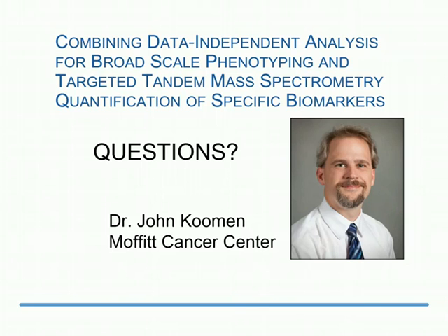What we'd really like to be able to do is have two inclusion lists, one for the DIA and then one for targeted MS2, where you could just say, I know for this particular peptide it elutes at 30 minutes, so I need a two-minute window, say from 29 to 31 minutes, to monitor this with targeted MS2, and then you could stack a very large number of those measurements in parallel. But that's something that we have to lobby for from the instrument company and get that capability. We're trying to do that a little bit with time segments, but it's quite a bit convoluted. It would be much easier to do with two inclusion lists.